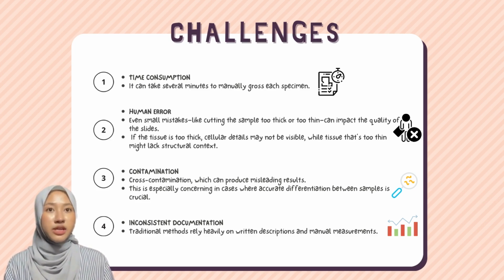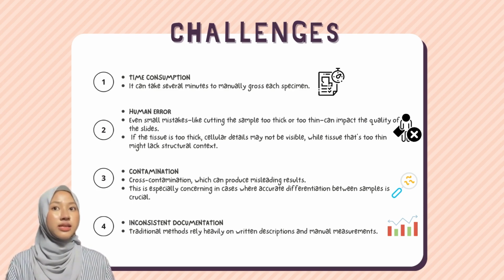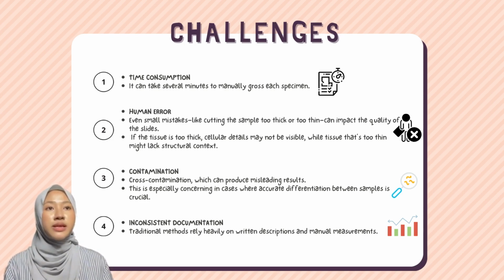Next, contamination is another critical concern. If tools are not adequately cleaned between samples or if tissues are handled improperly, there is a risk of cross-contamination, which can produce misleading results. This is especially concerning in cases where accurate differentiation between samples is crucial, as contamination can lead to misdiagnosis.